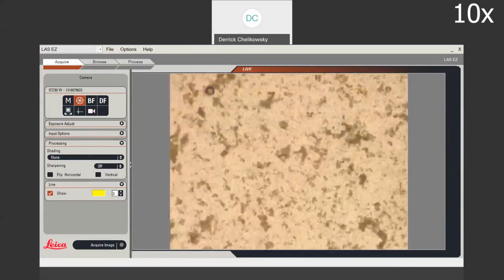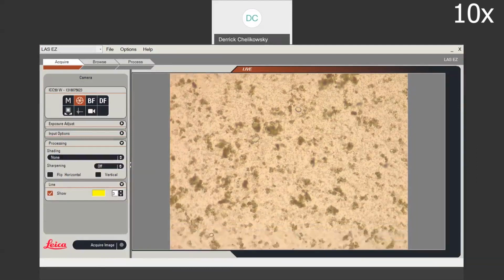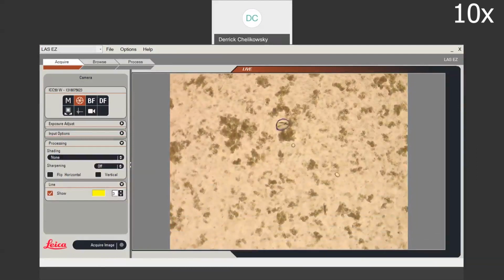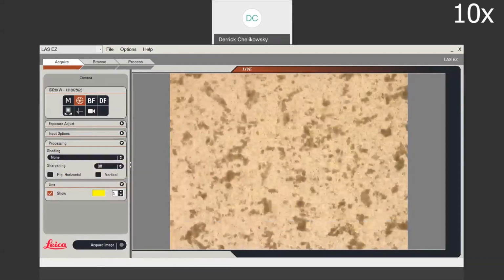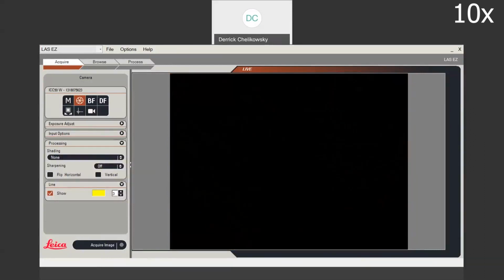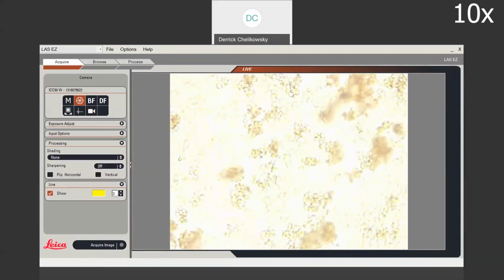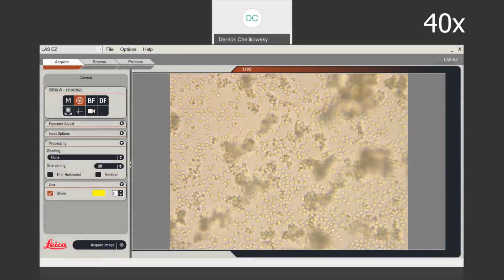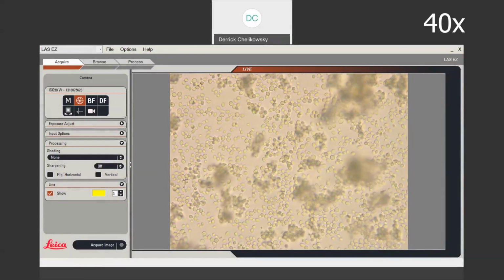In the lab, you would be looking through your own ocular micrometer, and with that you would be able to measure out the cells themselves. The next thing we want to look at is the movement. Now I'm just peeking around, playing around with different locations, seeing if we can find a nice one. And this is our 40 times, and as you can see, we have gotten to the point where we can see individual cells and see their movement.